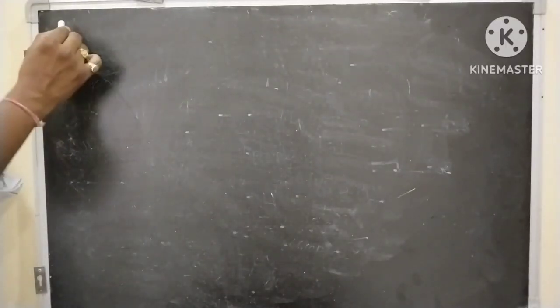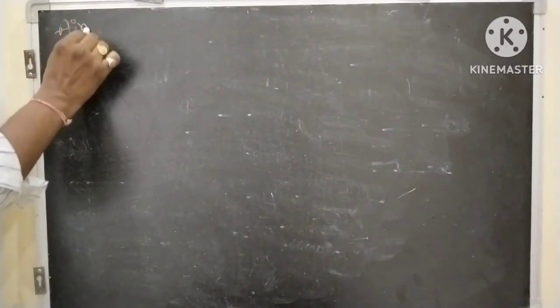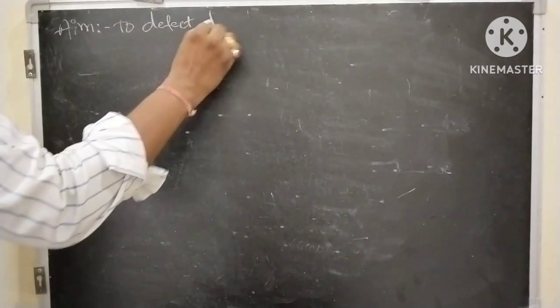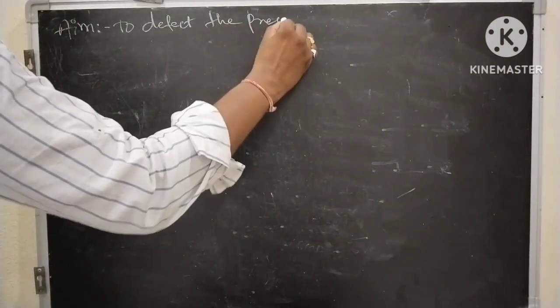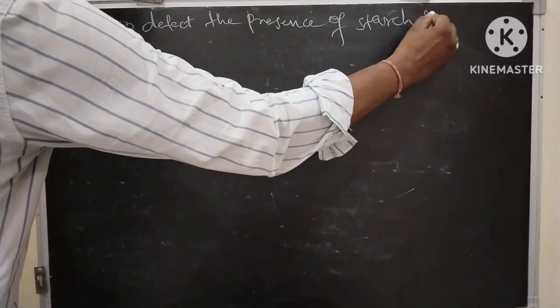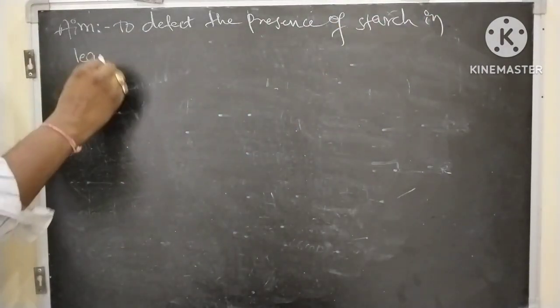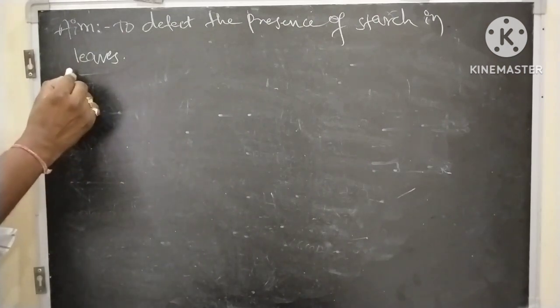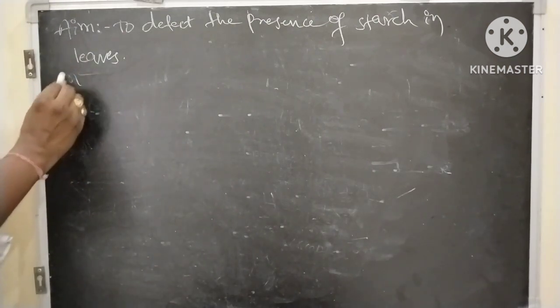Hello everyone. Today our topic is to detect the presence of starch in leaves. For this, we require some materials.